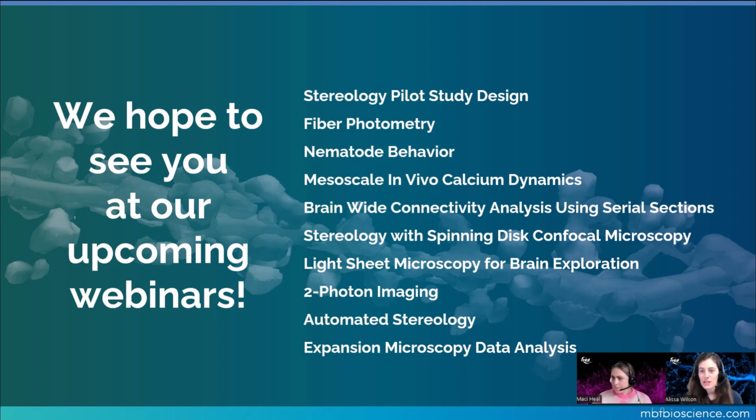I can grab the first one. One of the questions that came in is, can you reconstruct other things with Neurolucida 360 besides trees and vessels? And yes, you can reconstruct somas, spines, puncta, varicosities. You can also create contours, so making any anatomical boundaries that you need. And there's also markers that can be used to identify unique features.